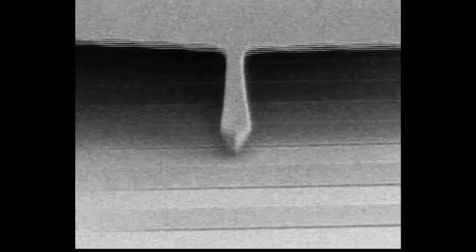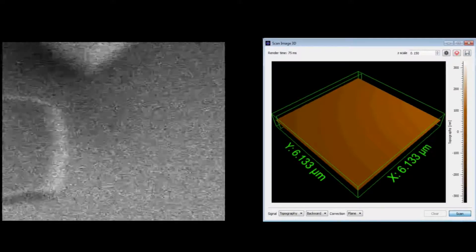Our AFM allows high resolution operation of the electron microscope, for instance at 4 millimeters working distance in the so-called high resolution mode.